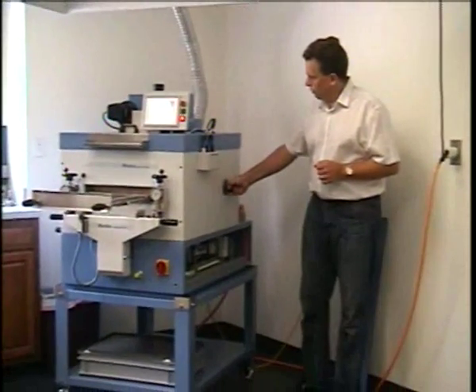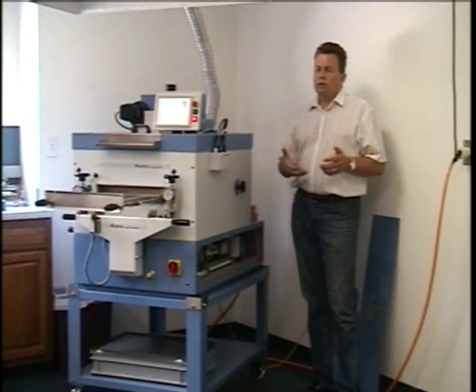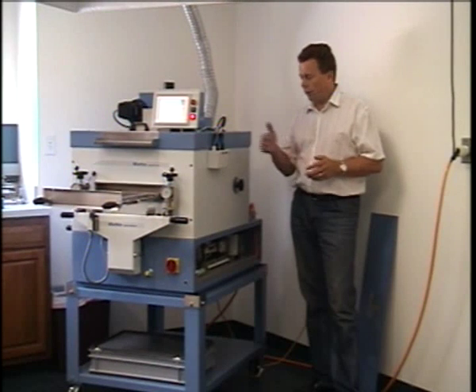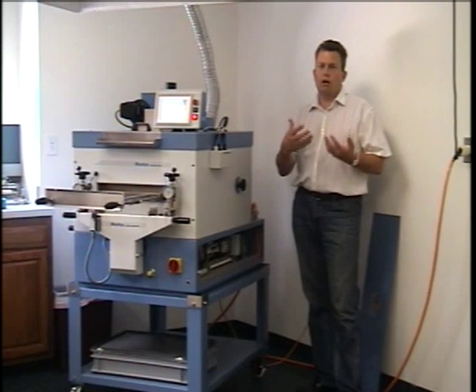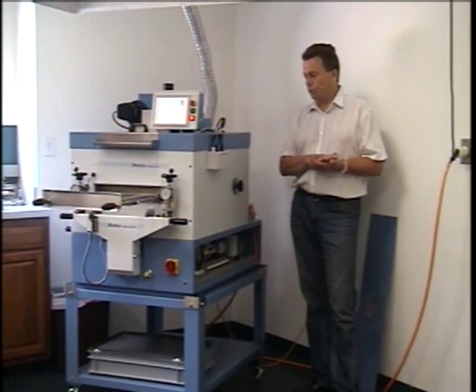So to start out, we'll put it back to 0. Especially when you do coatings, if you have solvent-containing coatings, you probably want to direct a little bit more air to the bottom. This will heat the sample from the bottom up and drive out the solvents before you form a skin on your coating sample.